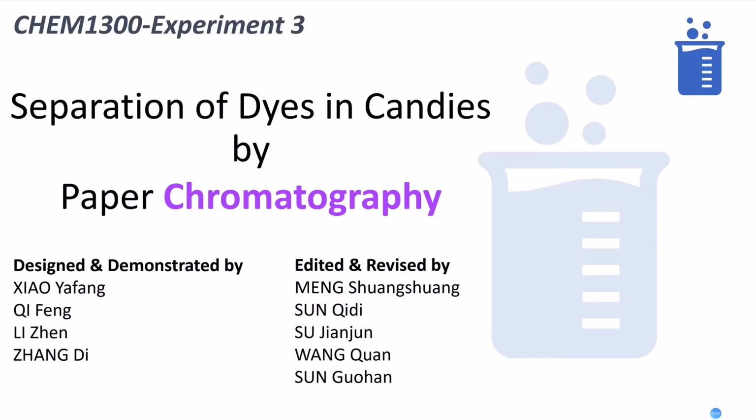Hello everyone, welcome to experiment 3 for the principles of general chemistry: separation of dyes in candies by paper chromatography.